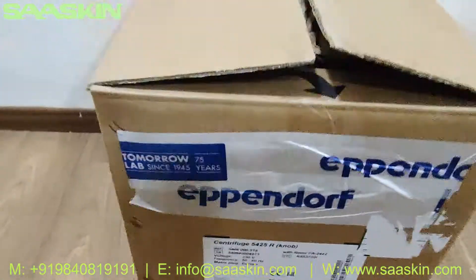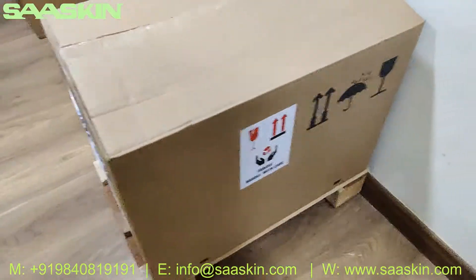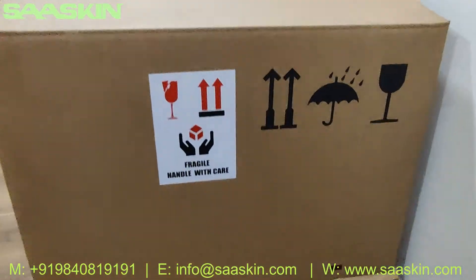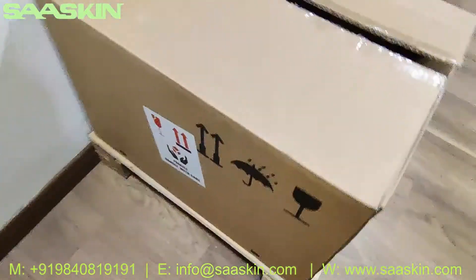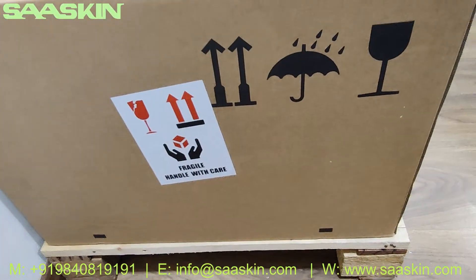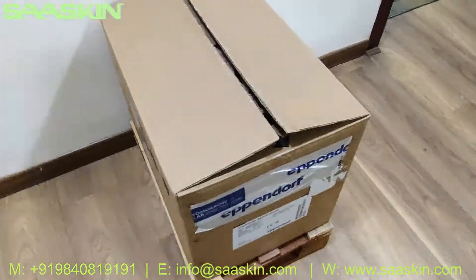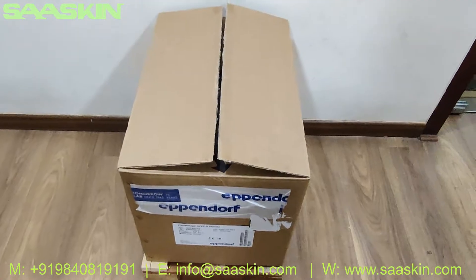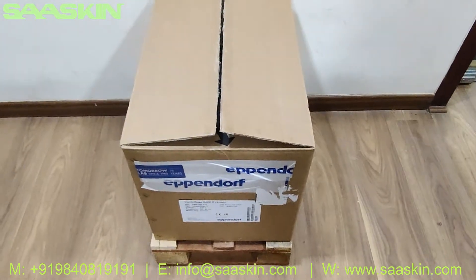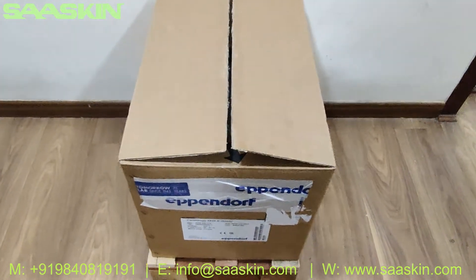I'm going to unbox this. Let me show you the other side — this is how the other side of the box looks. This is the condition in which the carton has been received. Now I'm going to open this and show you the contents inside the box.